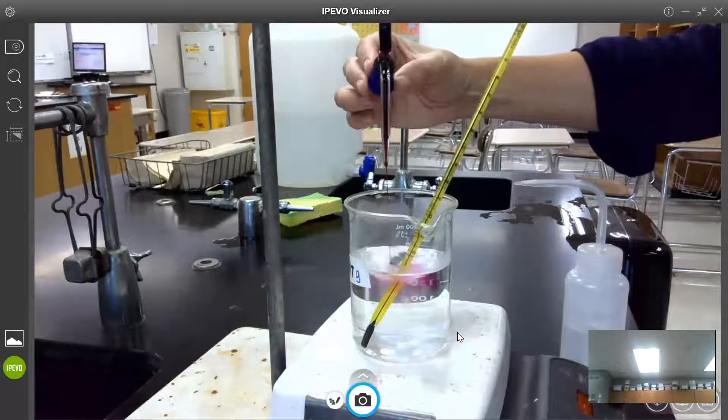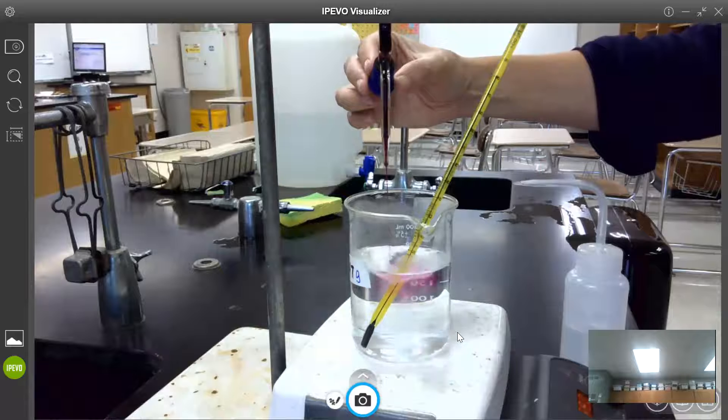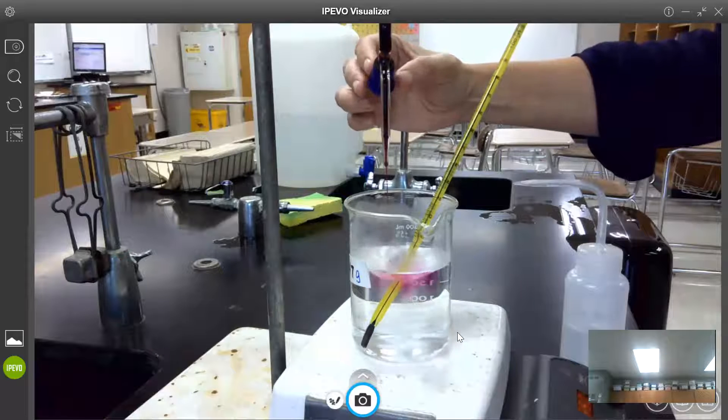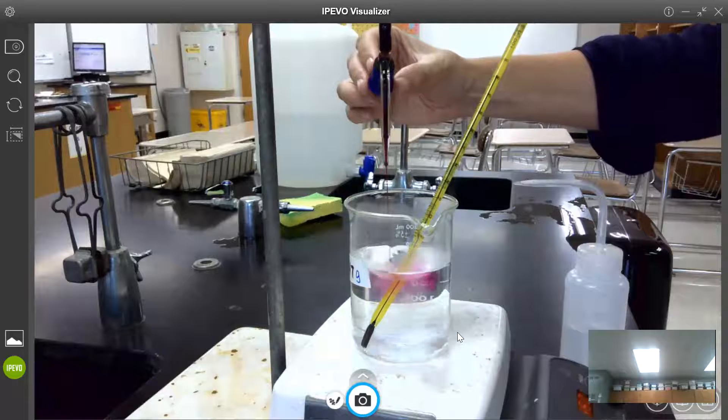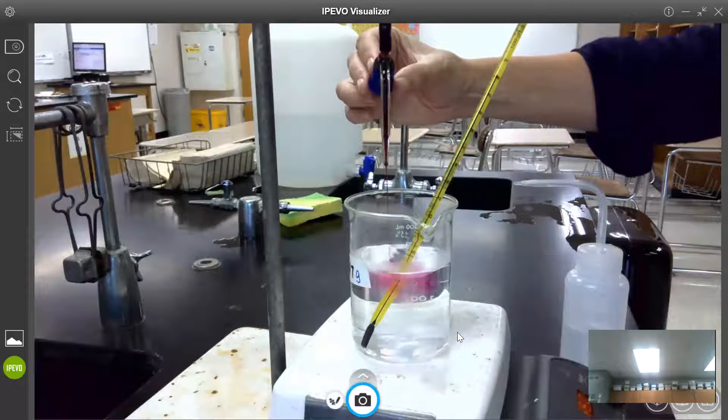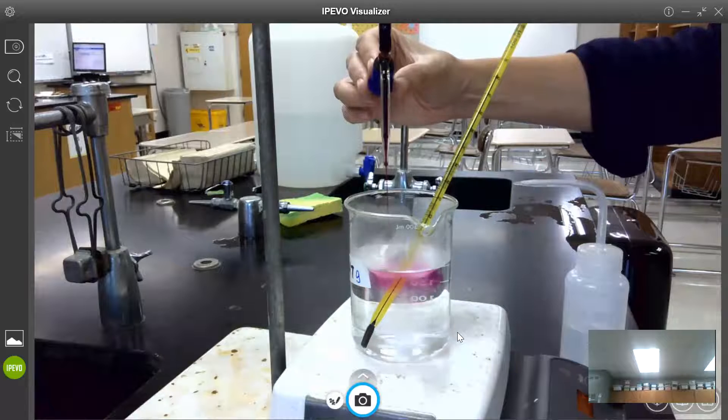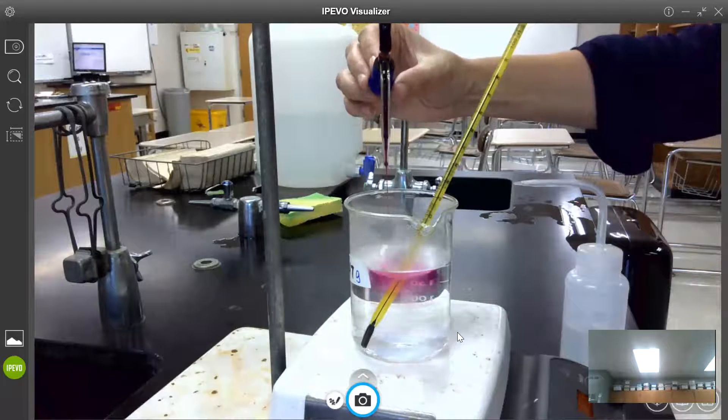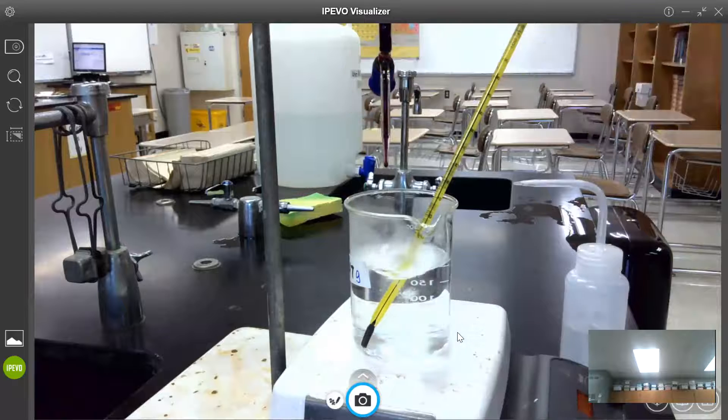And so you can see I'm adding a steady stream and the color is immediately dissipating. So just to give you an idea of the volume that I've added so far the burette reading right now is about 41 milliliters and I'm stopping.